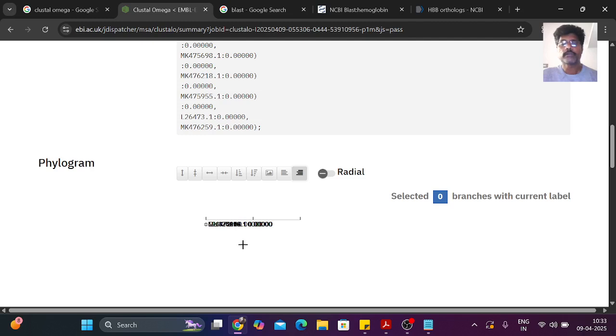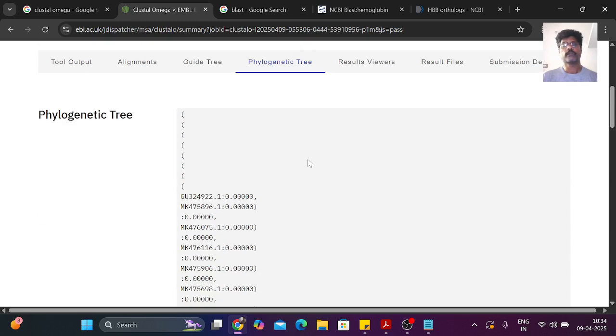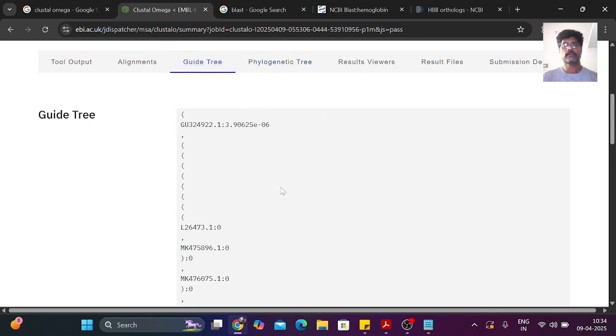So only numbers, everything is in a single origin. So that is the problem here when you are working in BLAST, right? Everything is correlated. Everything is closely related. So only one root is available here, so all the clades will be in the single, I think, maybe. Okay, we will see in the next example.